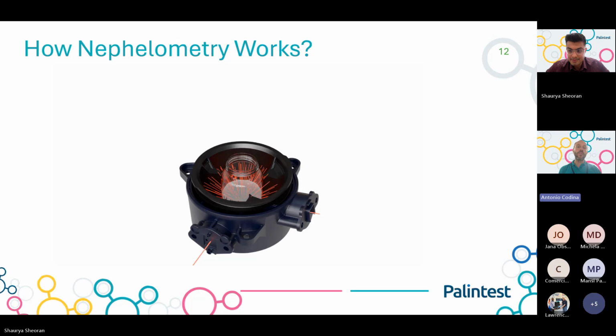If you have stray light in your instrument, it means that some of that light that is bouncing is reaching your detector and you're reading more light than what you actually want. You're getting higher results than what you would expect. Makes sense. Thank you.